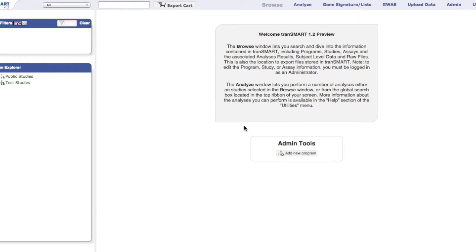In this tutorial, we will be demonstrating the Browse and Search functionalities within TransMart. To look for all studies and programs on the site, click the Browse button on the top menu bar.